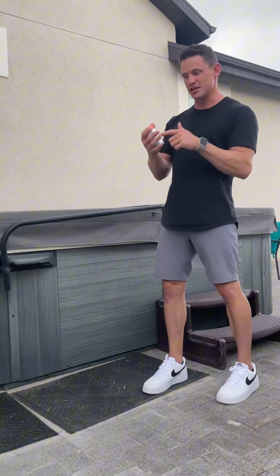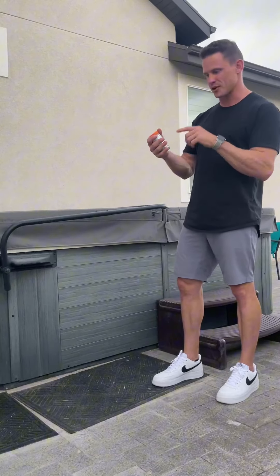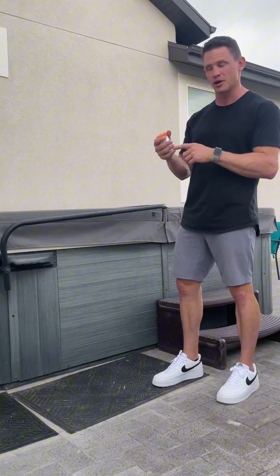I've got this hot tub here, but more importantly I've got these test strips that I'm super excited to share with you guys. These are the Dr. Tim Wang test strips, the seven-in-one. Most test strips that you've probably used for your pool or hot tub might only be four-in-one — this one has seven. I'm going to flip the camera around, show you all the different things, and then we're going to do a test on this hot tub to see where it's at so you can figure out how to adjust to have the perfect balance.